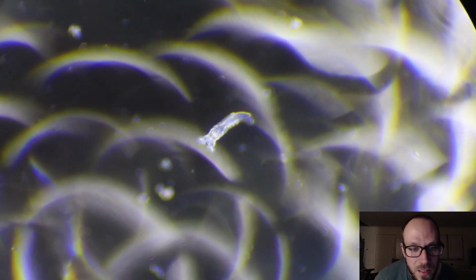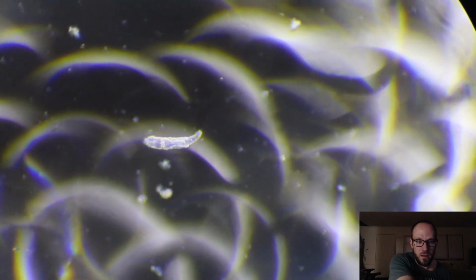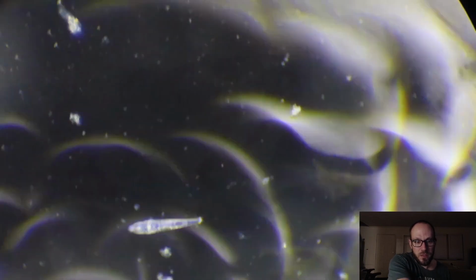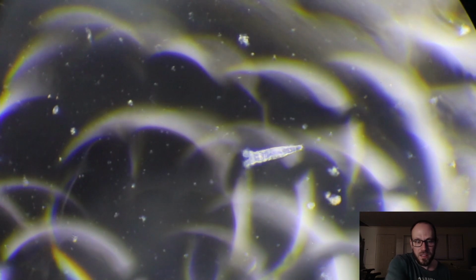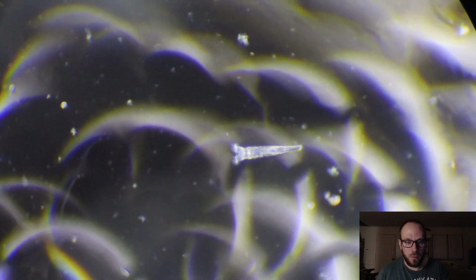There you go. You can see. I think it's just so beautiful. These rotifers have about 1,000 cells to their whole body. And it's funny because we've seen single-celled organisms that are almost as large as they are. And again, these aberrations you see, these weird lights, are bubbles from the water that still hasn't dried up from the top of the slide from it being in the humidity chamber.